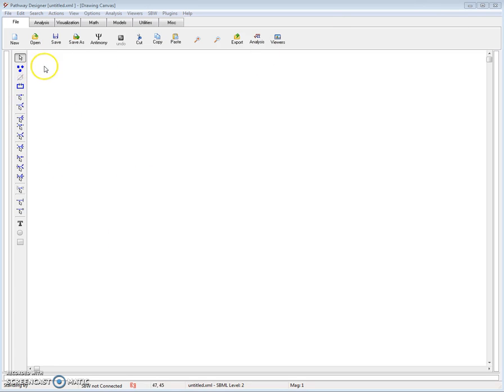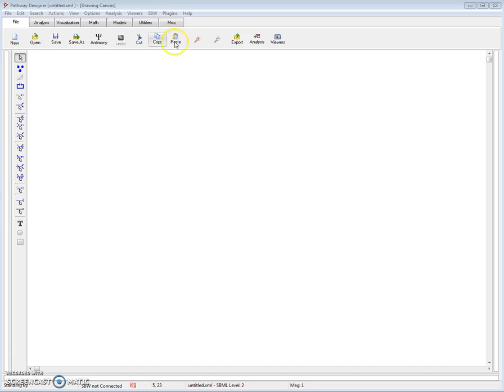On the screen here you see Pathway Designer. In the middle, in this large white area, this is the canvas on which you'll draw your network. Along the top is the toolbar where there are basic things such as loading and saving models. And then down the side, you have various things you can use to draw your network.